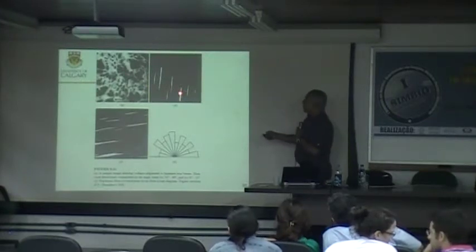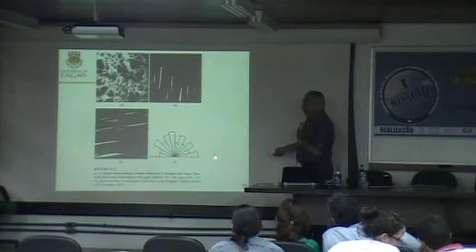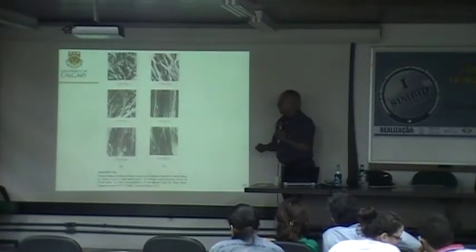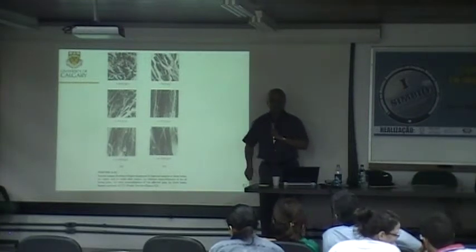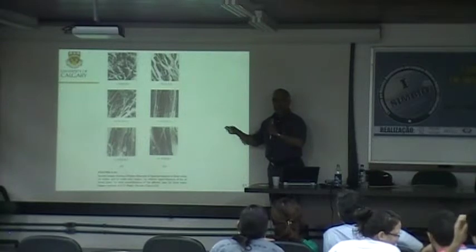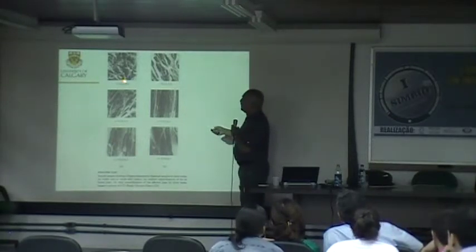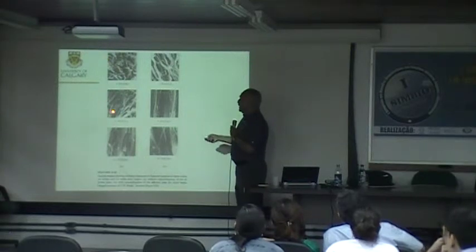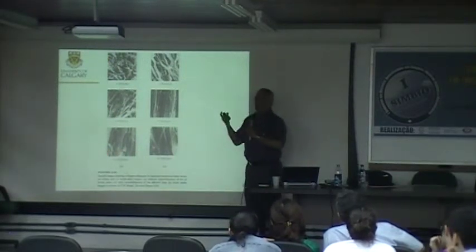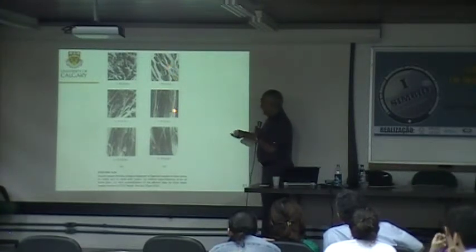In this case, there's a broader angular distribution, almost uniform. So we computed some statistics. These are images from samples, different rabbits, a number of rabbits, unfortunately. And this is 3 weeks after healing, 6 weeks, 14 weeks. The injury was surgically inflicted. And this is another set, 3 weeks, 6 weeks, 14 weeks.